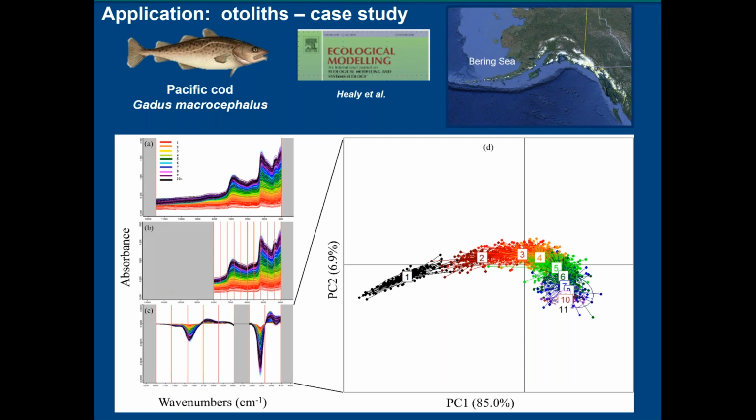The other topic related to that is that what we're trying to do, because we recognize that the reference data that we're using, which is the traditional age data, is biased, or maybe not biased, but certainly imprecise, or it has uncertainty. And so one of the techniques we're looking to explore is actually an age-specific bias correction in the prediction or in the calibration model itself, which could reduce bias from a subset of data that have been truly validated by some other methods.